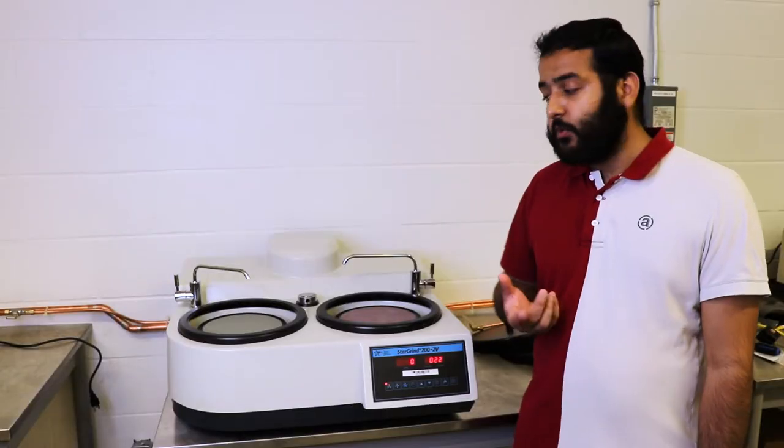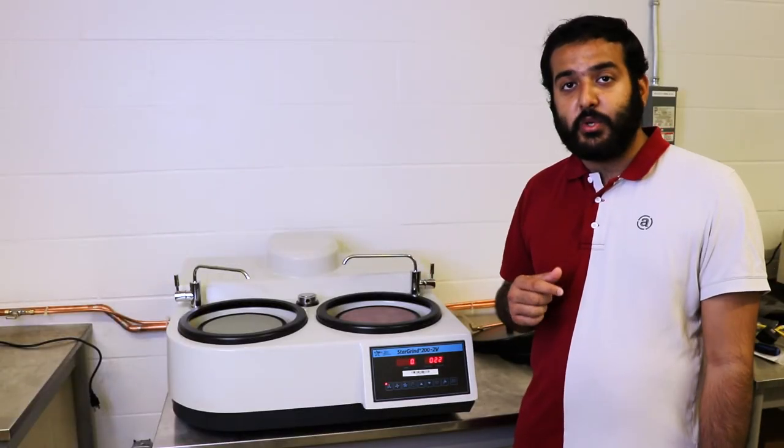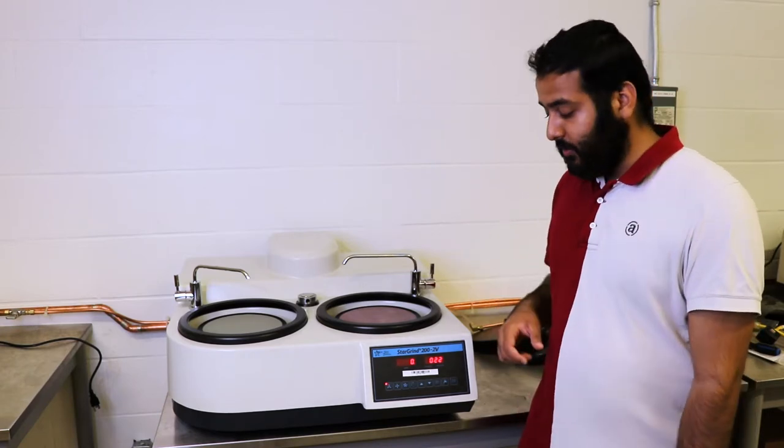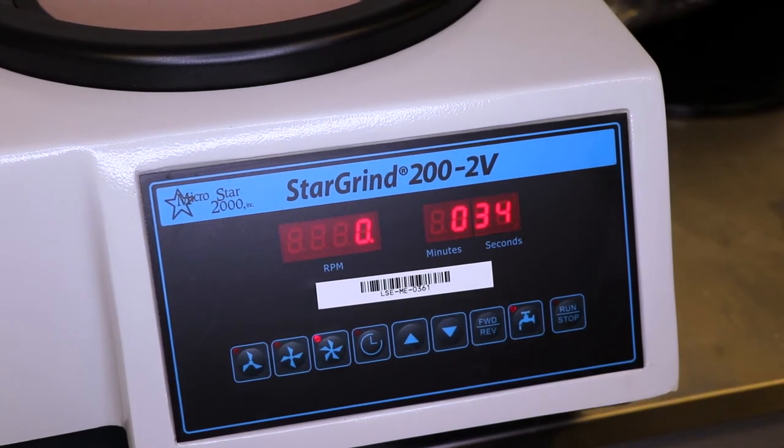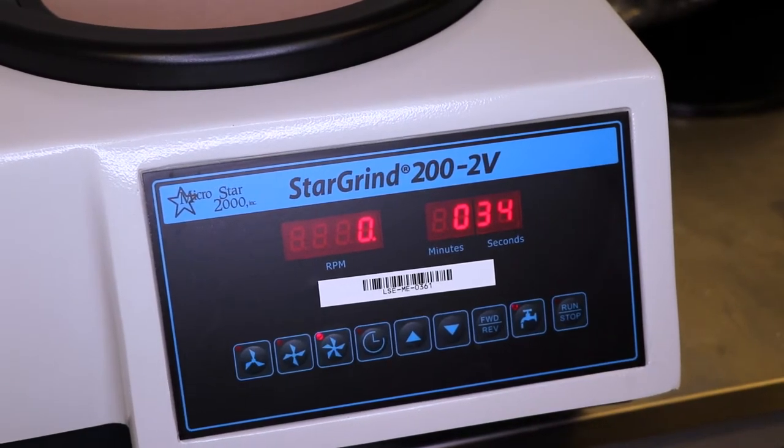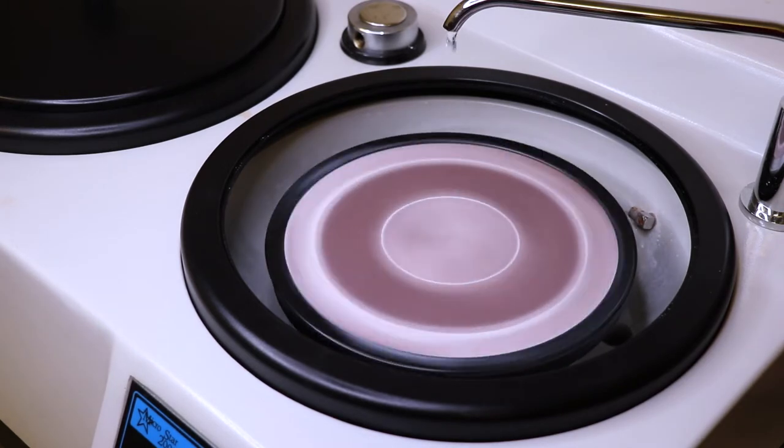If you notice there's a lot of buildup and debris, you can run a clean cycle, which is essentially when you're running the machine, you press this little fountain button on the console. This will run water internally to try to clean up as much of the gunk inside.